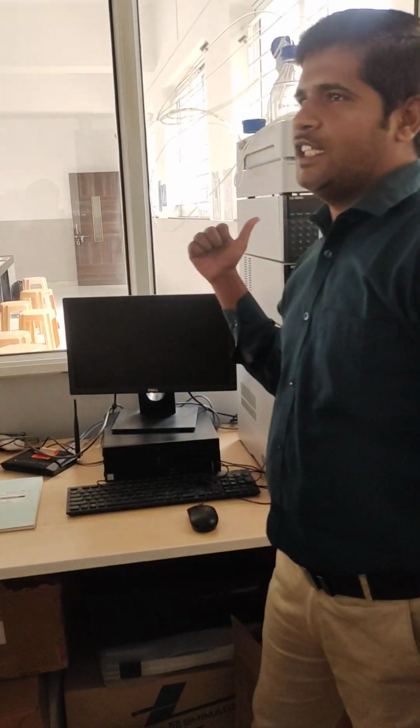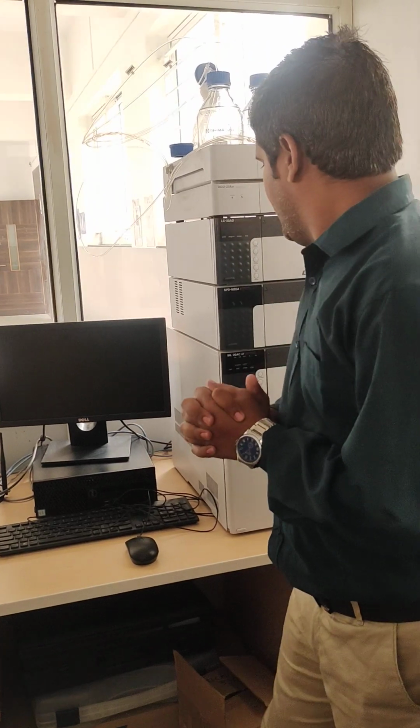We are discussing the HPLC, correct? We are doing the demonstration related to the HPLC. What is the main application of HPLC? Did you know? Separation of compounds. Only separation?